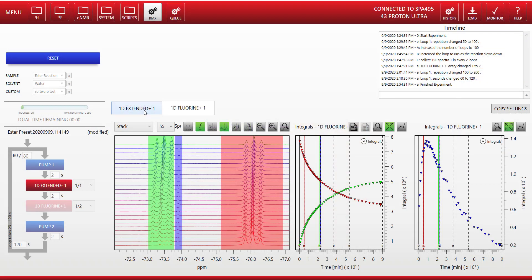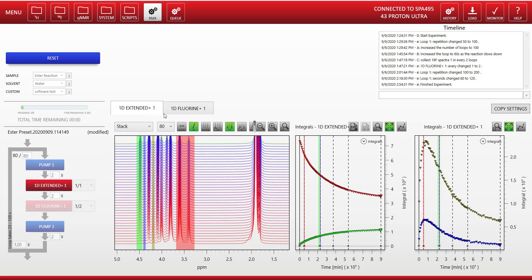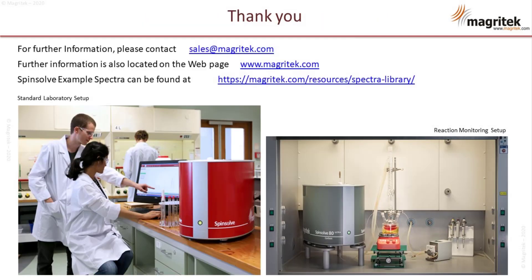As well as the PDF report, each 1D spectrum is saved separately and available for analysis later. If you want any further information about the SpinSolve Reaction Monitoring Software Module, please contact us at sales at magritek.com.